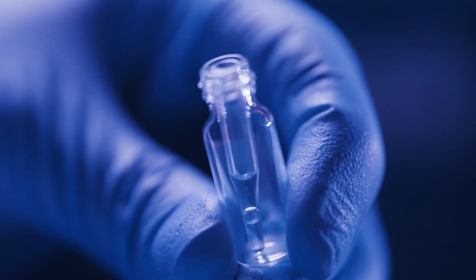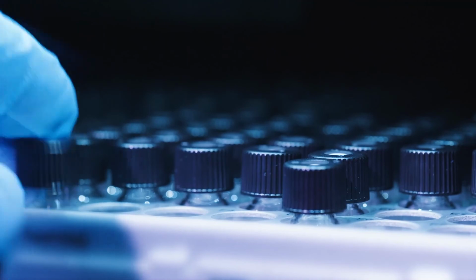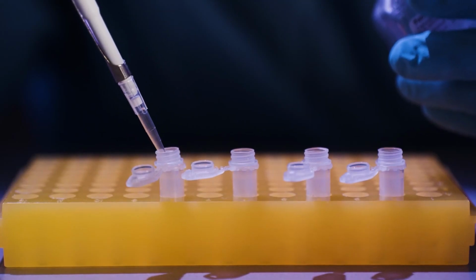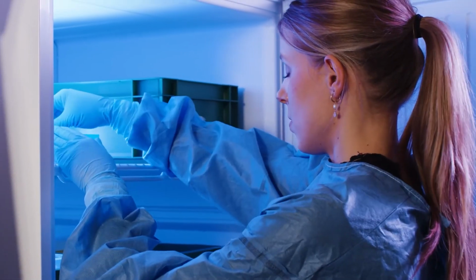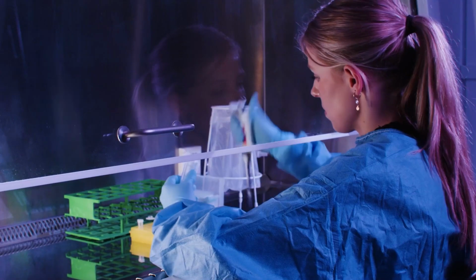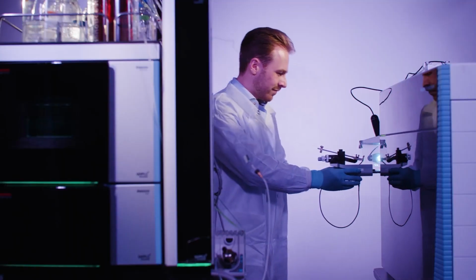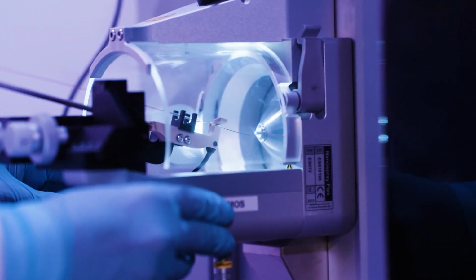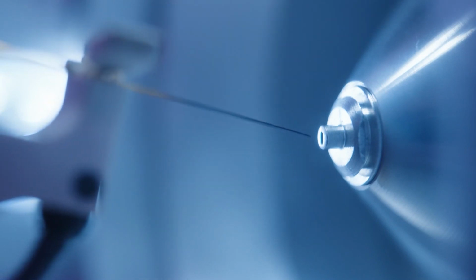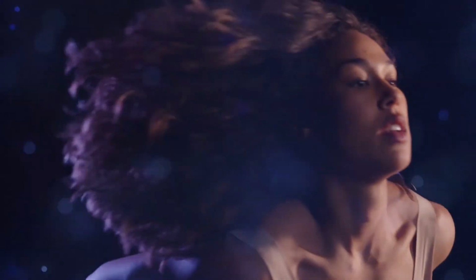Using mass spectrometry-based protein analysis, we can now directly monitor the repertoire of antibodies present in blood. Just a few droplets is enough for us to measure how a person is responding to an infection or vaccination. As a result, we can search for specific antibodies present in those who do not get ill, enabling us to identify the optimal weapon against the disease in question. The quest for the most powerful antibodies is only just beginning, but the solution to any disease might just come from within you.